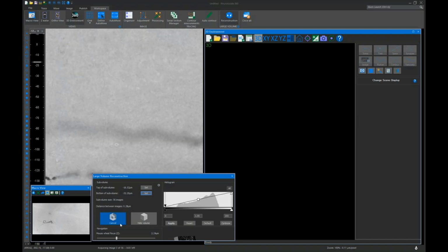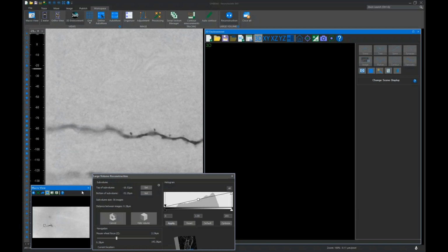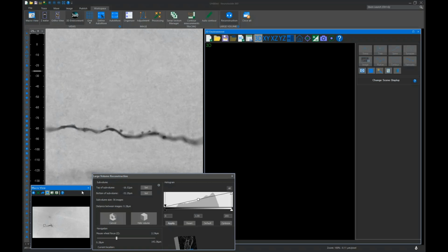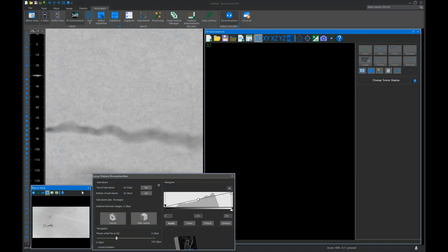And then all you have to do is click Reconstruct and wait. And so we got a question at the time of registration wondering about how to adjust the black point and white point and gamma of the images while you are working.